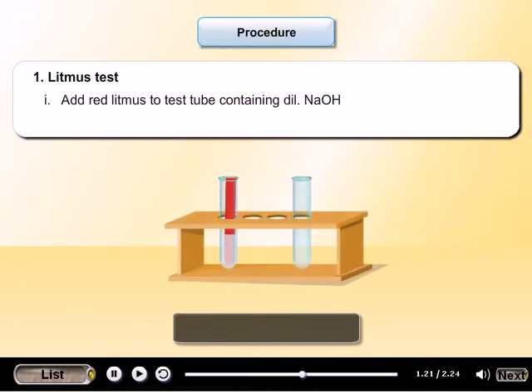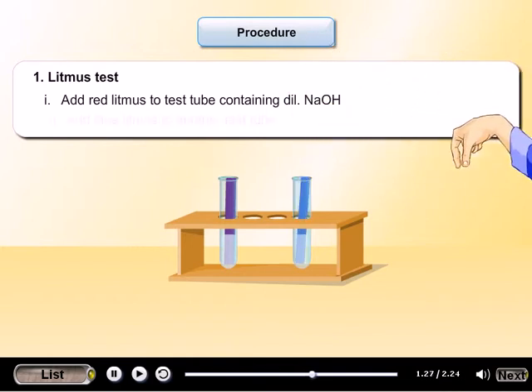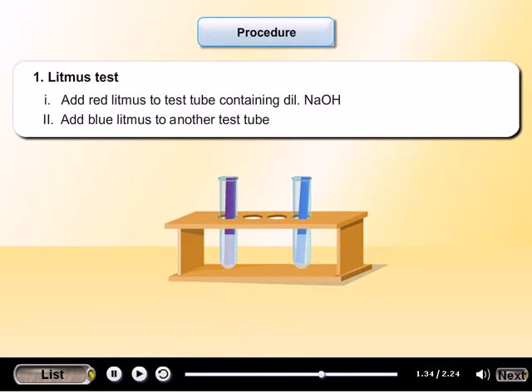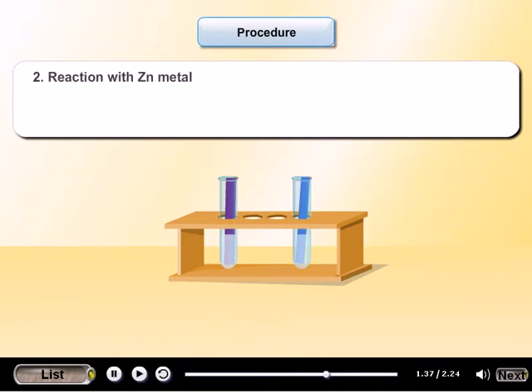Add red litmus to test tube containing dilute NaOH. Add blue litmus to another test tube.